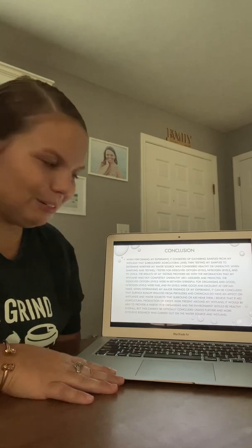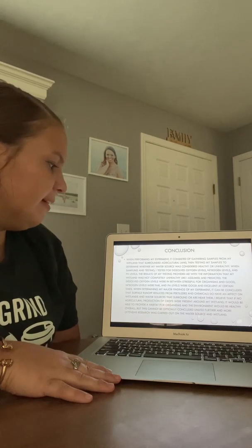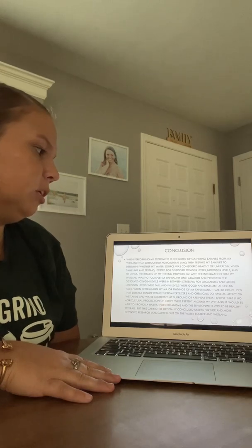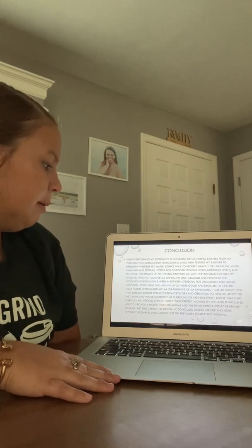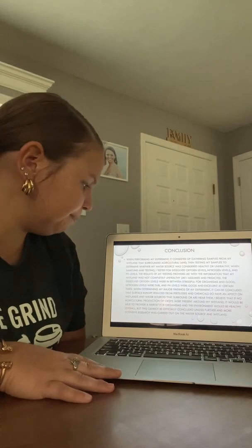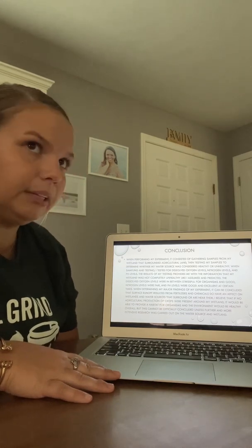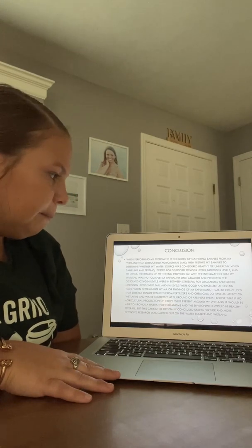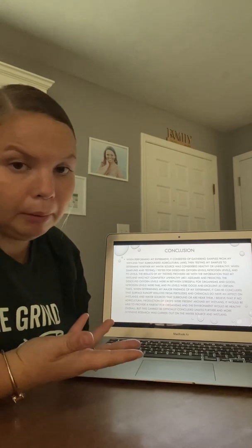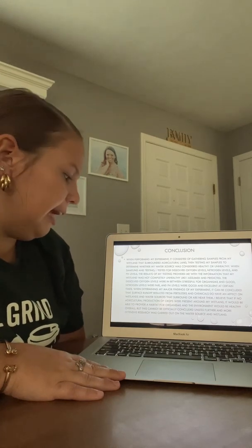Now on to my conclusion. When performing my experiment, it consisted of gathering samples from my wetland that surrounded agricultural land, then testing my samples to determine whether my water source was considered healthy or unhealthy. When sampling and testing, I tested for dissolved oxygen levels, nitrogen levels, and pH levels. The results of my testing provided me with the information that my wetland was not completely unhealthy like I assumed and predicted. The dissolved oxygen levels were in between stressful for organisms and good, so it was in between. And nitrogen levels were fair, and pH levels were good and excellent at certain times.